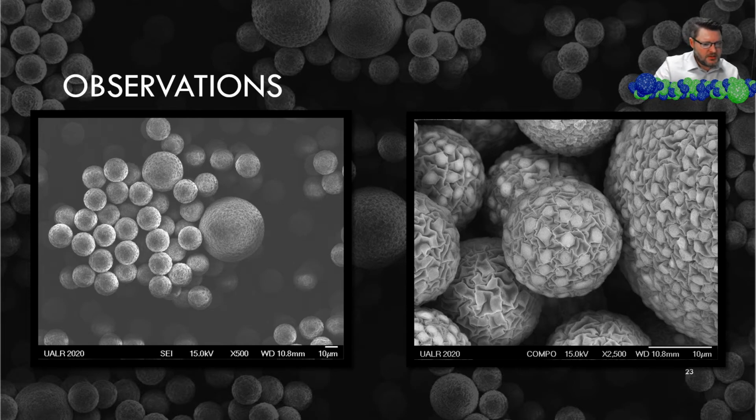Again, some more images. I'm just going to let everybody look at this. Pretty interesting. The image on the left is a 500 times zoom. The image on the right is a 2500 times zoom.